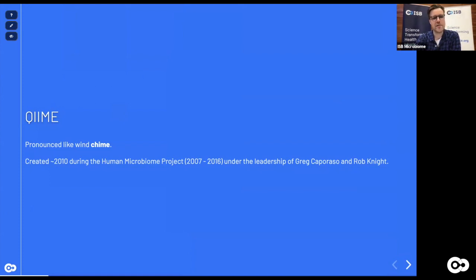It was created around 2010 during the Human Microbiome Project that ran from 2007 to 2016. The main leadership of Qiime's design is still with Greg Caporaso even today, and it was done within the group of Rob Knight. You might have heard of Rob Knight as one of the major people operating in the microbiome field.